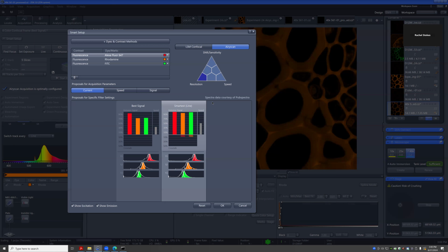Plus you don't have to be here. You could be at the other PC and just open the data there, because you'll see it in a network folder. That's why I like having the PCs networked too, because you can access everything that's been generated here over there, as long as you have that auto save. It'll spit it out in that folder and you can just open it right there. That's always handy to have.